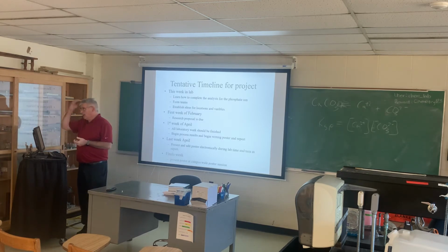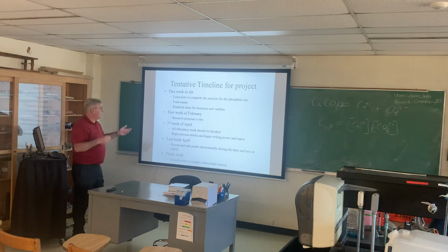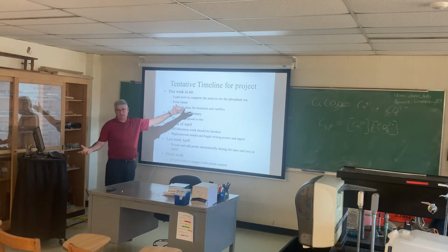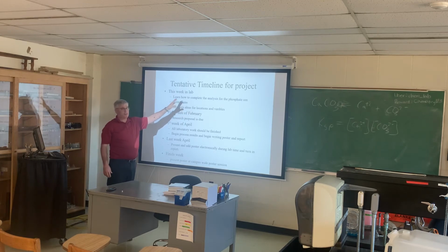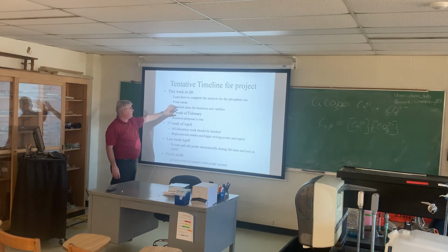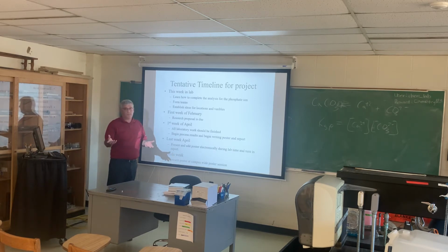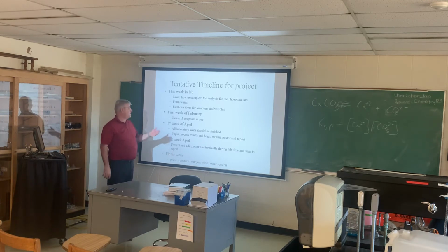And all right, a timeline. So a timeline for this project. This week in lab, you're going to complete the phosphate analysis for an unknown sample here. So in other words, you're going to make a calibration curve, and you're going to take the equation from that straight line to find the concentration of an unknown.